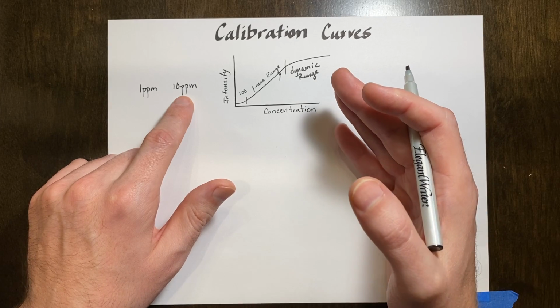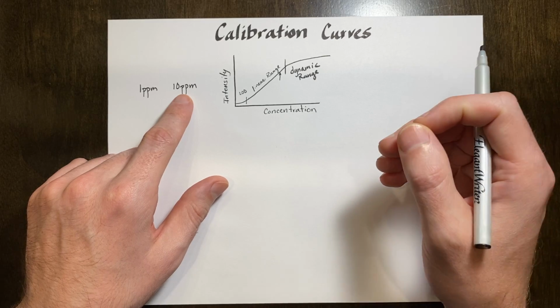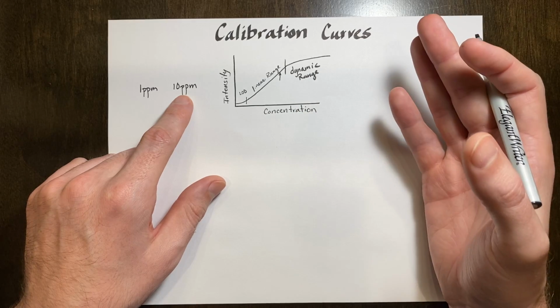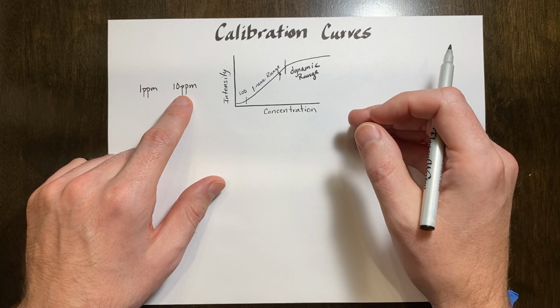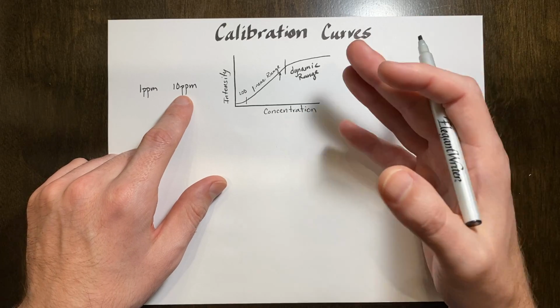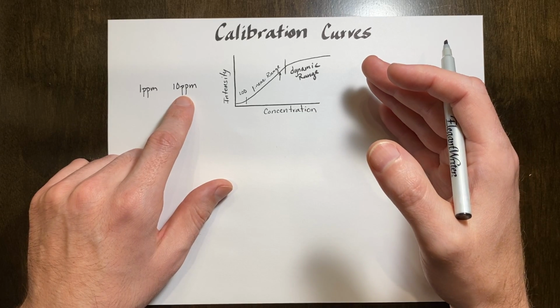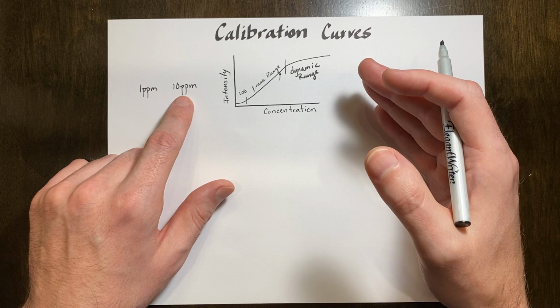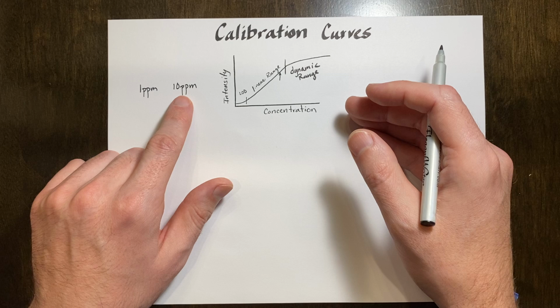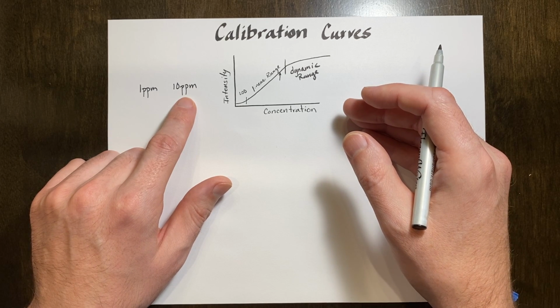Preferably, you'd go with 100 milligrams, or perhaps even a tiny bit more. We are talking about very small quantities of reagents, and especially when we're talking about copper, which is not an expensive element, let's go ahead and say the minimum we should weigh out is 100 milligrams. If we were to try to weigh out 100 milligrams and then directly make this particular concentration from that, we would find that the volume required is rather large.